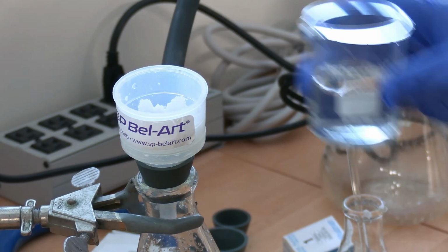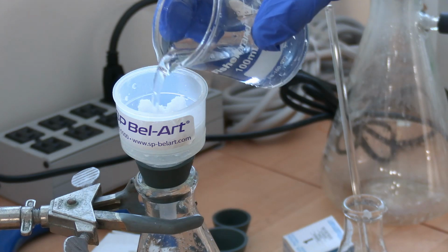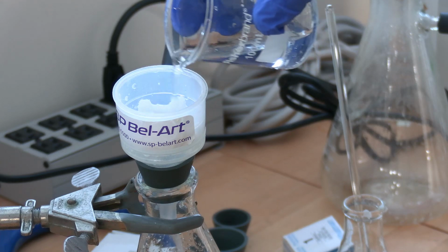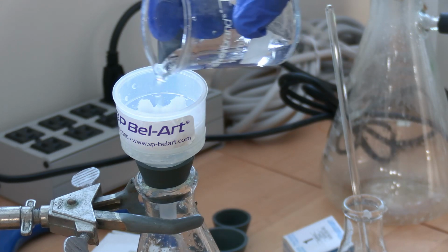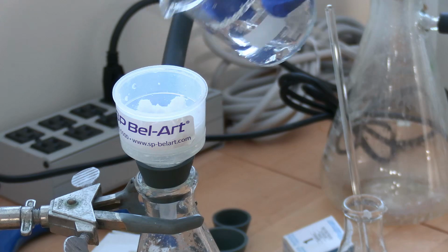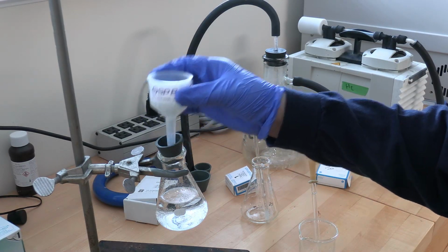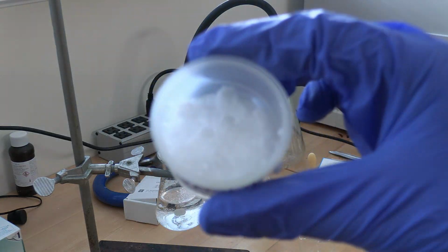The final step in our procedure calls to wash the crystals with cold water, which is several portions of 5 milliliters of cold water, and allow the crystals to air dry on the funnel. Once there appears to be no more solvent, take the crystals out. Now that the synthesis is complete, I'm going to let this dry overnight and then weigh the crude product.